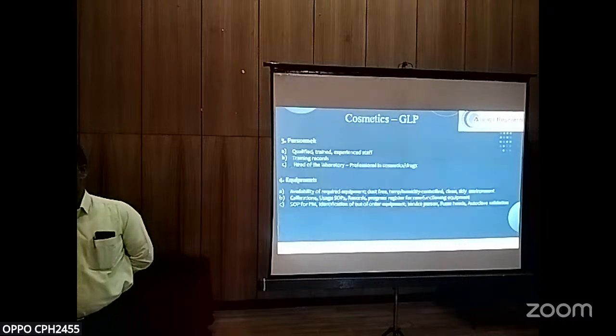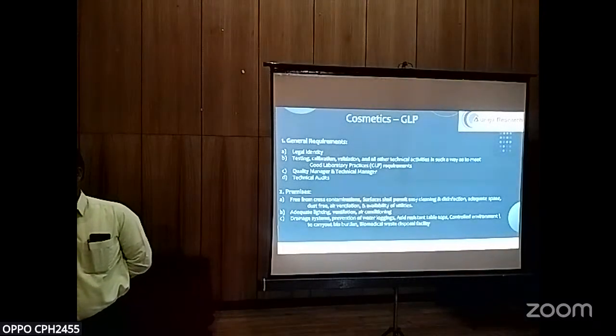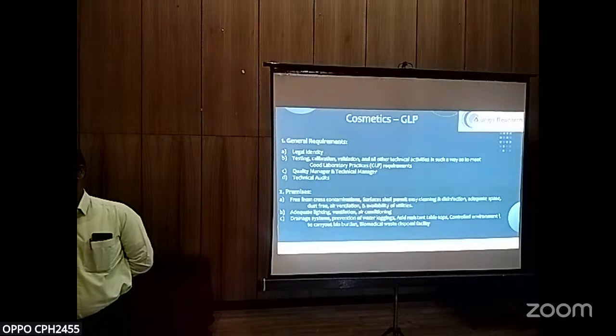Then premises should be free from cross contamination, surfaces shall permit easy cleaning and disinfection, with adequate space, dust free, air ventilation, and availability of utilities.